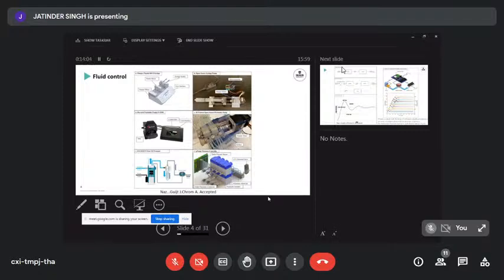Depending on whether your application is sensitive to that or not, you may want to pick one over the other. If you really don't want any kind of pulsative flow, the pneumatic systems are really, really smooth because you control the pressure of the gas in a tube above the liquid. That means you've got constant pressure, and therefore a very nice and stable constant flow rate. You need a fair few solenoid valves though to control a pneumatic fluidic system.